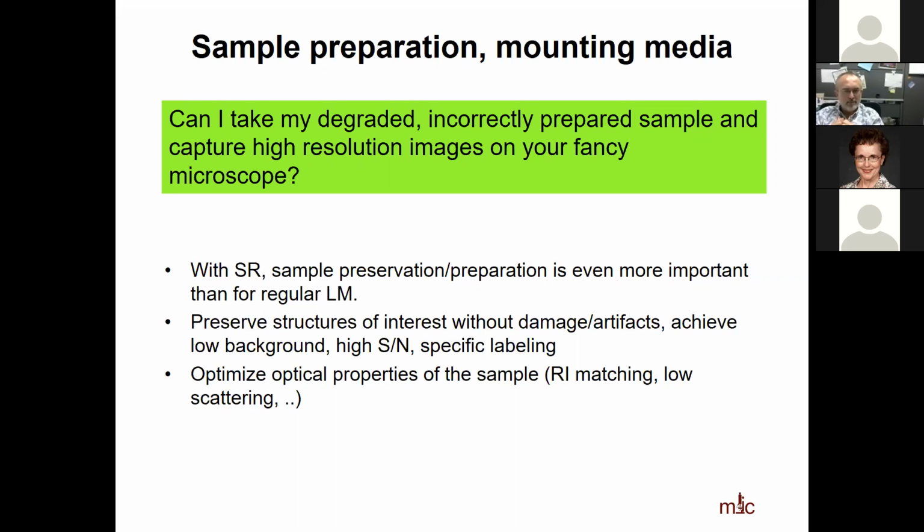I have one more, Doc. Yes, please. We work on zebrafish, and we're looking at brain neurons. If we were to get a live sample to actually see neuron processing, say, for instance, nanodiamonds between the neurons, it'd be a moving type of sample. What kind of microscopy would be best for that?